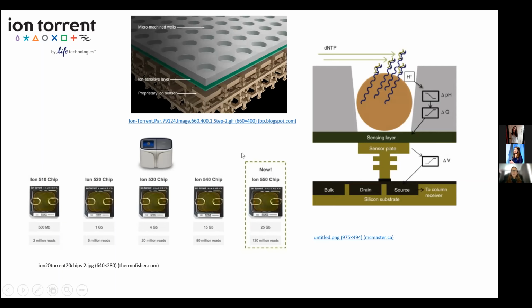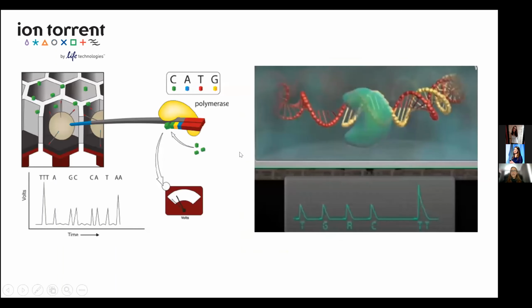When we have loaded our sample on the chip, we can proceed with the sequencing process. During sequencing, each nucleotide is introduced onto the chip one at a time.